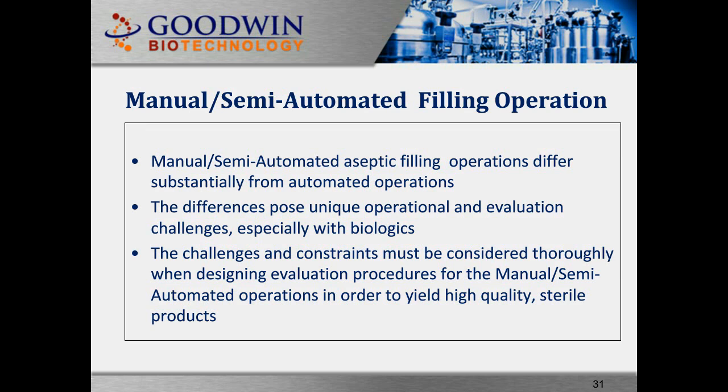Manual semi-automated aseptic filling operations differ substantially from automated operations. The differences pose unique operational and evaluation challenges, especially with biologics. The challenges and constraints must be considered thoroughly when designing evaluation procedures for the manual semi-automated operations in order to yield high-quality sterile products.